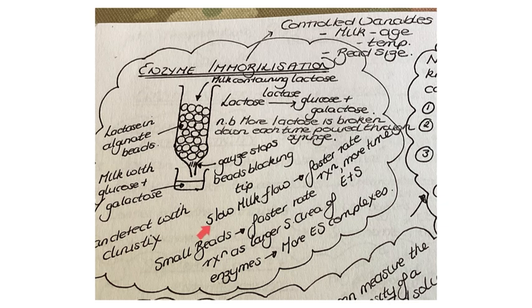It's good when you're doing this to slow the flow of milk. You'll actually end up with a faster rate of reaction because it gives the enzymes and substrates more time to collide and form enzyme substrate complexes.